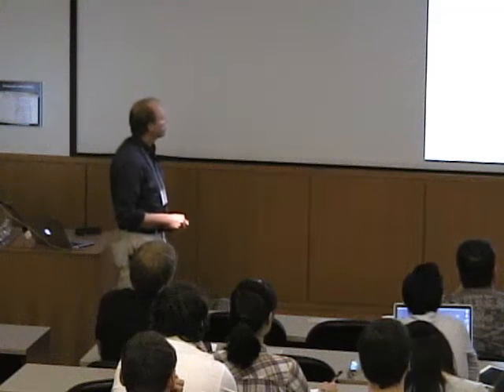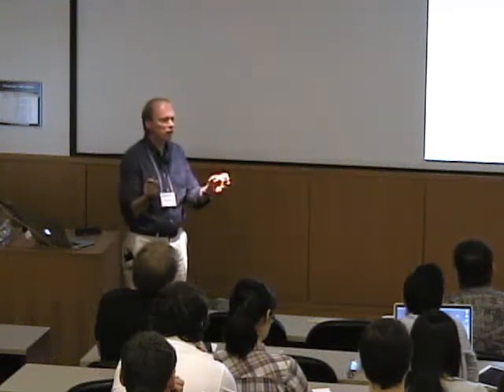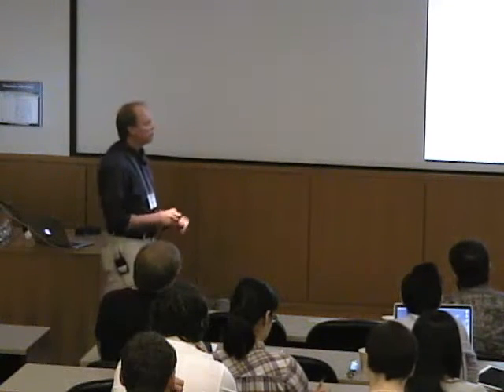And then the other thing is that the couplings, so the interactions between electrons, are much stronger than in NMR. In NMR, the nuclei are well separated. They don't move around, so they don't interact nearly as strongly as electrons, which are delocalized and can approach each other much more closely or come in much closer contact with the nuclei and so on. And so this leads to really, really broad spectra in EPR, right?